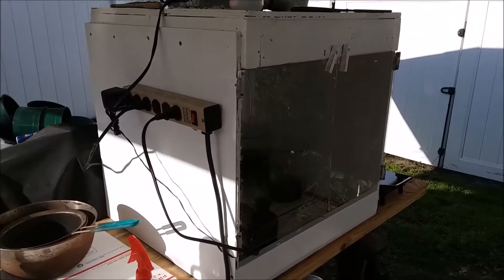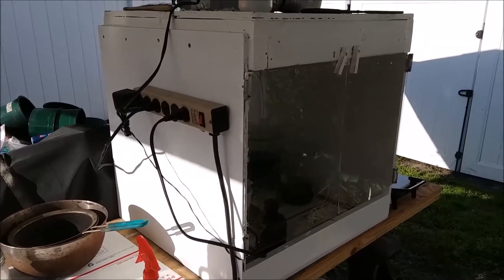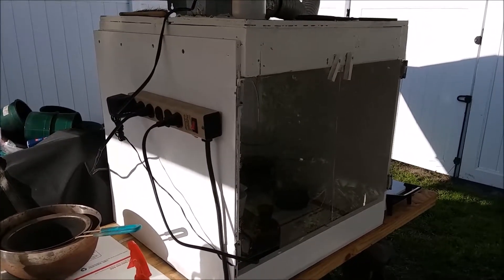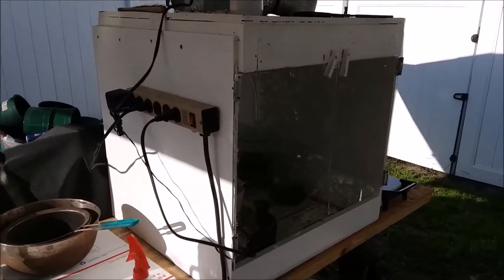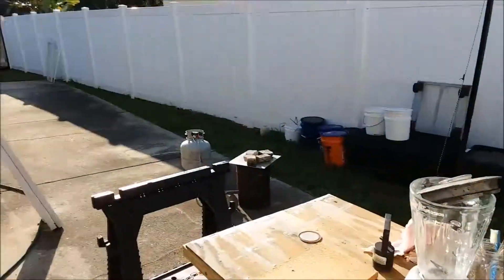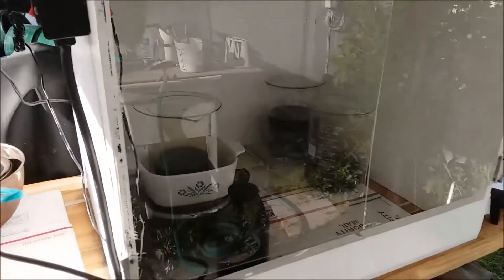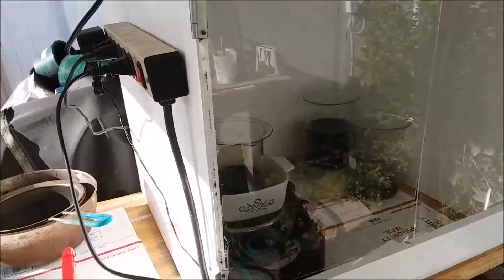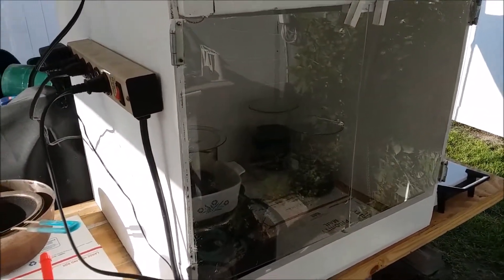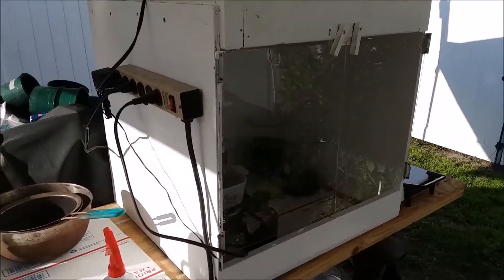Here's an update. The segment I shot yesterday about all the condensation was on a very humid day — it had been raining for three days straight and the humidity was at a hundred percent, so there was a lot of condensation coming out of the fan. Today's a different story: it's been sunny, warm, and dry, and I've been using this thing pretty much all day again and I've seen hardly a drip of condensation. So it's not as bad as I thought yesterday, but I think I will still move the fan.